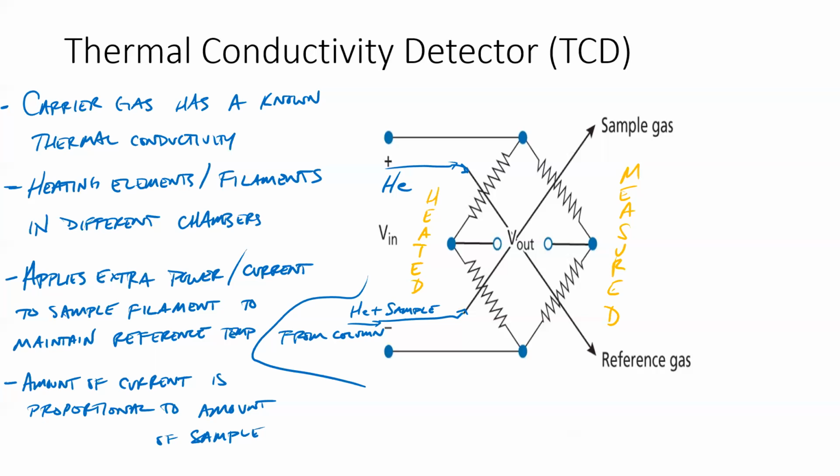And again, that's the type we have. I don't know if you remember, but our GCMS has, of course, a mass spec detector in the front column, but it also has a rear column, and that rear column is not hooked up to the mass spec, but it's hooked up to a TCD detector.